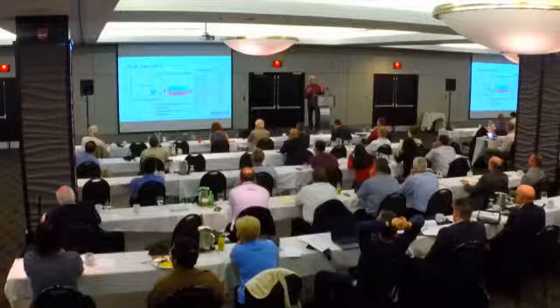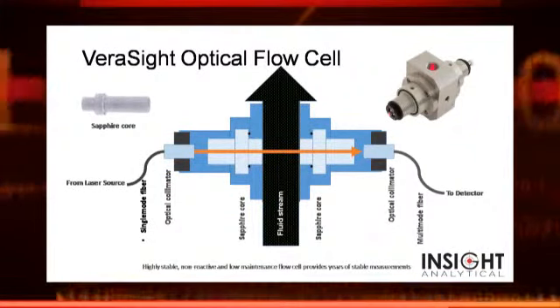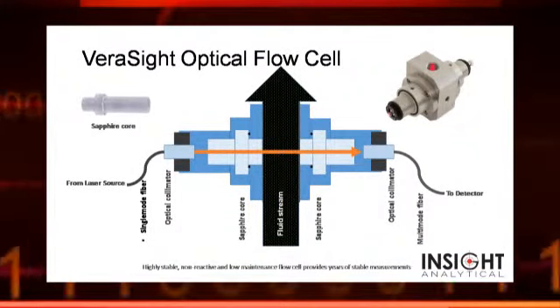Now I can take a measurement, and I can get this chemical data, and I can get it in real time. But the other big thing we want to concern ourselves about is, can I do it reliably and can I do it robustly? So one of the things that we've been doing now is to take that measurement directly out to the process. Rather than bring that sample back over to an analyzer building, we put a probe out at the process. We end up with a configuration that looks kind of like this.